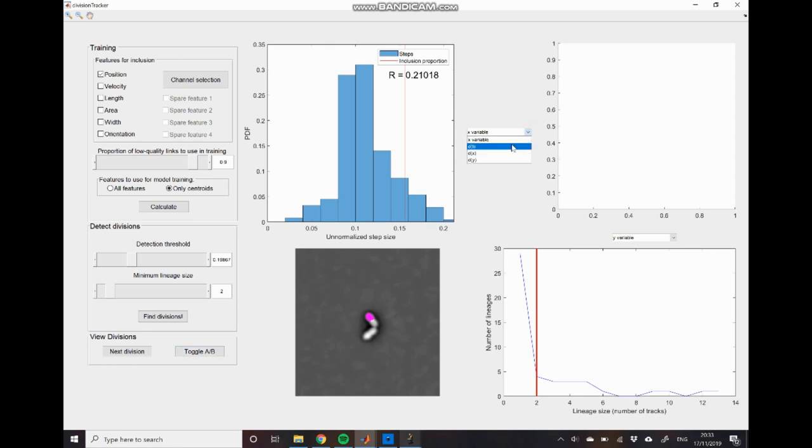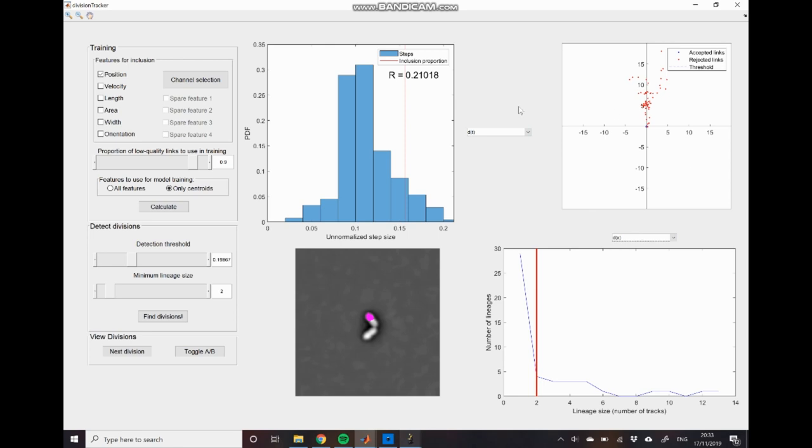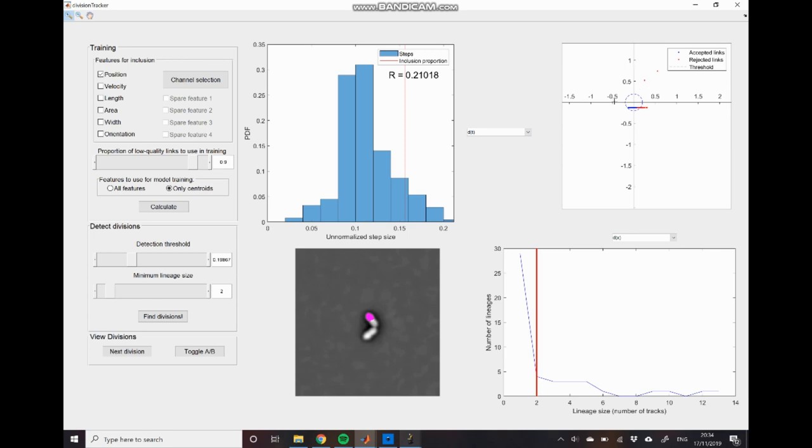And finally we can look at the normalized displacement space window. Here I've used this time difference feature that I mentioned before just to show you how that ends up looking when we look at the normalized displacement space. And you can see that our detection threshold is eliminating a lot of these points which we probably want to be including. This is probably why our division detection is failing at the moment.